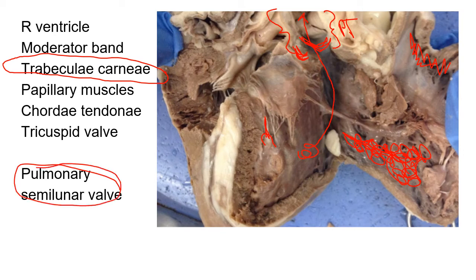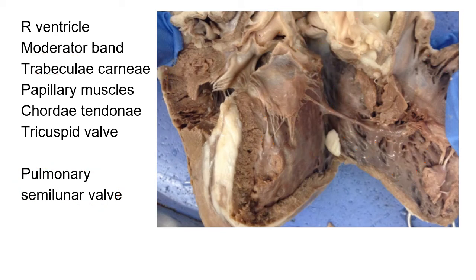So again, I'm going to erase. I want you to use your landmarks and pause the video and practice identifying all of these structures on this picture. And it's a good time to remind yourself about functionality as well.